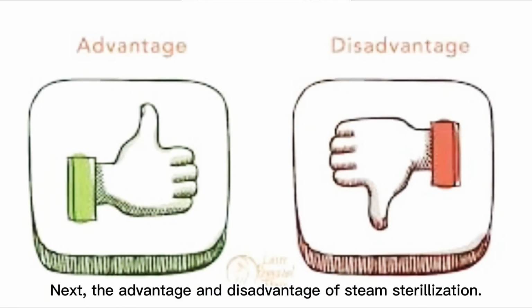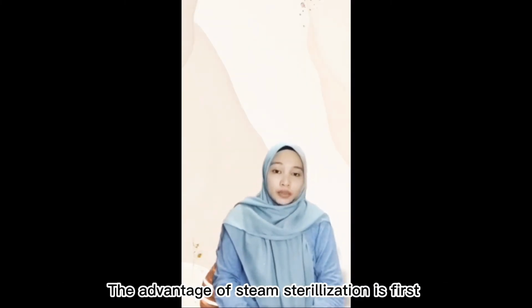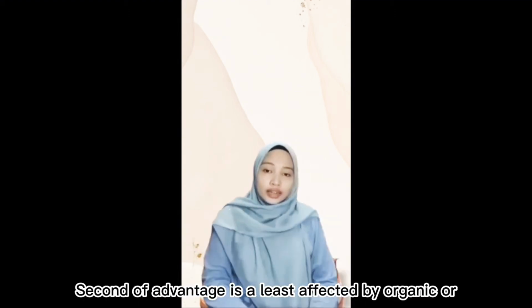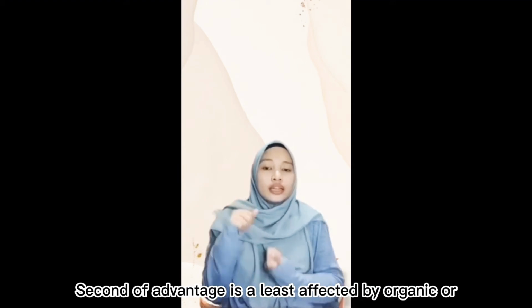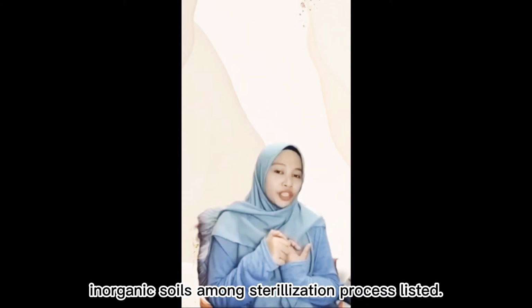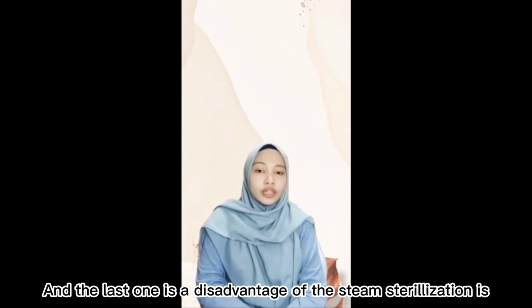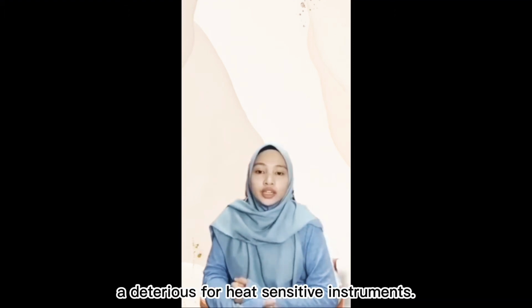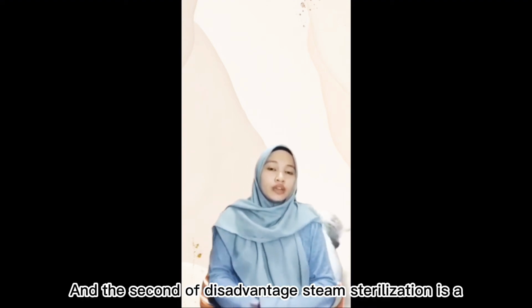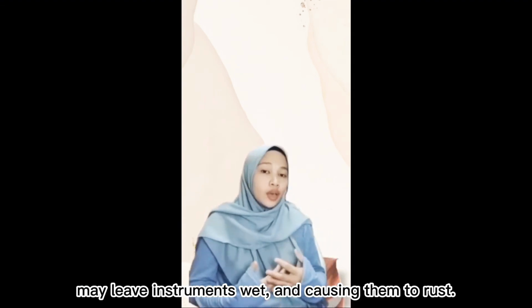Next, the advantages and disadvantages of steam sterilization. The advantage of steam sterilization is, first, low cost, safety and efficiency. The second advantage is that it is least affected by organic or inorganic soils among the sterilization processes listed. The disadvantages of steam sterilization are, first, it is dangerous for heat-sensitive instruments, and second, it may leave instruments wet and cause them to rust.